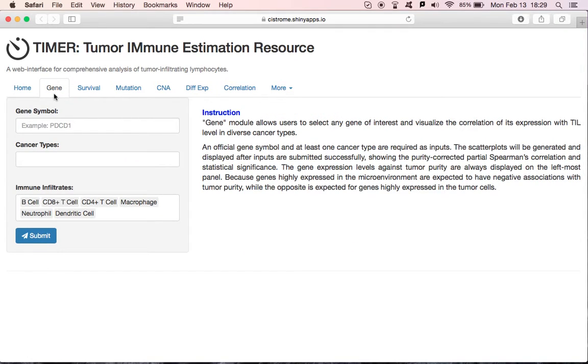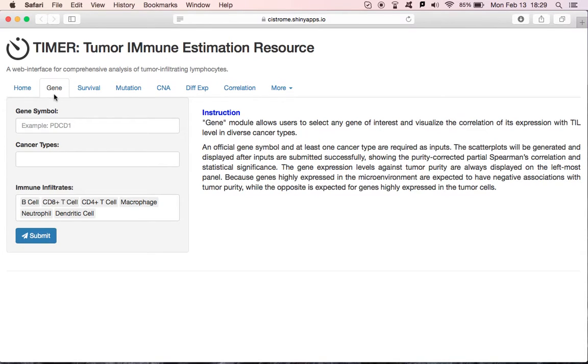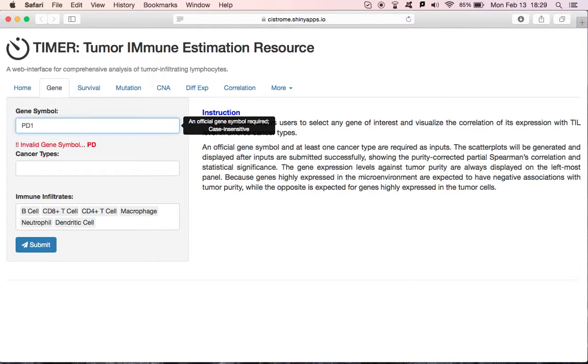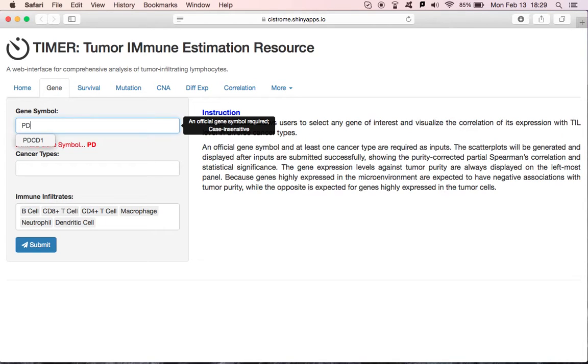During tumor development and progression, cancer cells and immune cells interact by multiple genes and pathways. If you want to look at the correlation of gene expression with immune cell infiltration level, you can input a gene symbol here, like PD-1. There is a red hint to prompt you that PD-1 is not an official gene symbol. Let's try PDCD1.